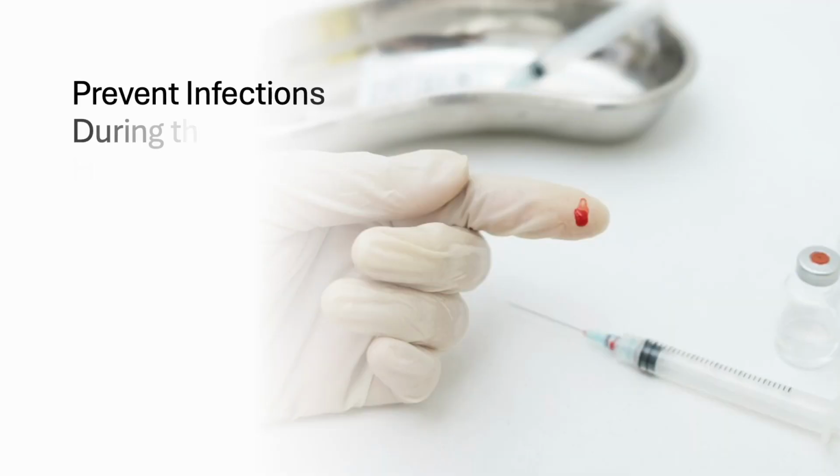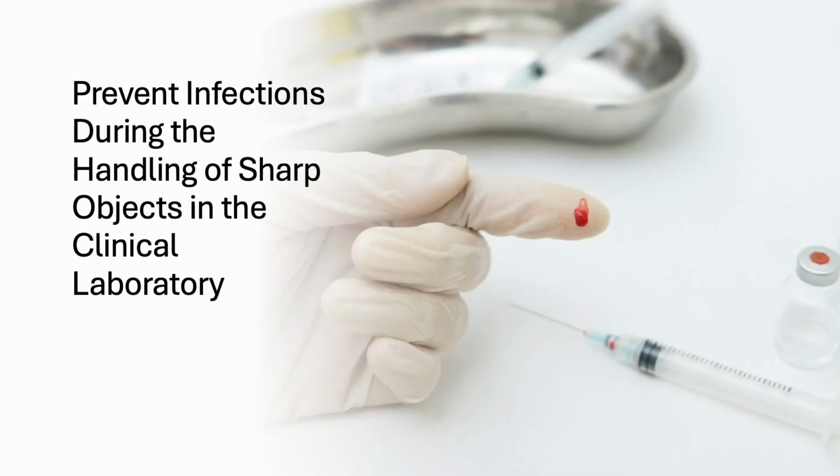Healthcare personnel exposed to needles face an increased risk of needle stick injuries, which can lead to serious infections with bloodborne pathogens like hepatitis B, hepatitis C, or HIV. It's crucial to learn how to protect yourself and your colleagues from such injuries. Workers at risk include nursing staff, lab workers, doctors, and housekeepers. Needle stick injuries often occur due to unsafe practices such as improper needle handling or disposal, transferring fluid between containers, or not using safety engineered sharps.